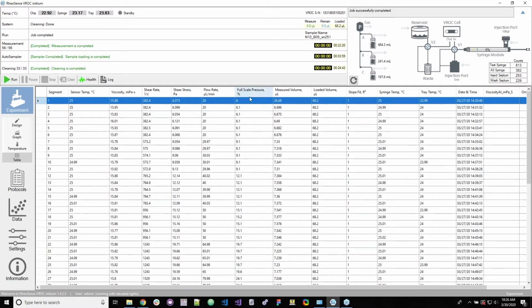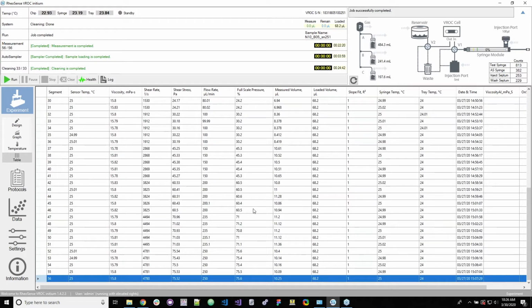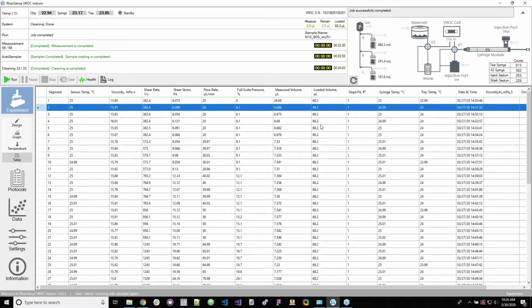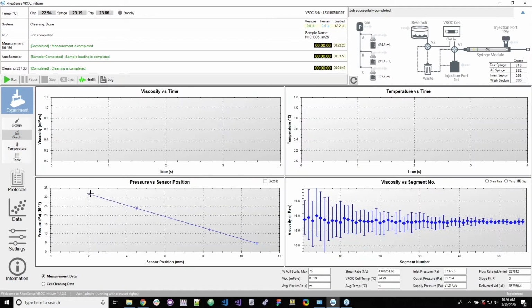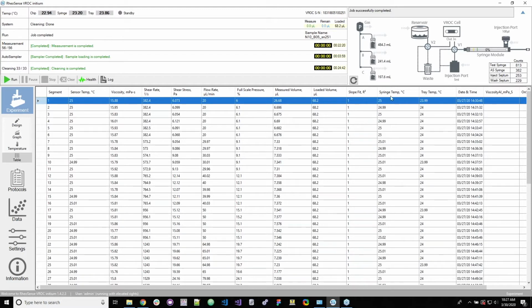shear stress measured, the flow rate used, the percent full scale pressure, which is the percentage of the maximum pressure that the chip can withstand for that given measurement. So 6% all the way up to 75% for this particular experiment. And then here it'll keep track of the measured volume for that run, and then the loaded volume from that particular test syringe, and then what the slope was for the pressure graph, so the R² value of this. So with an R² value of 1, that's really good. That's what we're looking for. And then keeps track of the syringe temperature, the tray temperature, the date, time. So, all right. So that was the experiment tab.